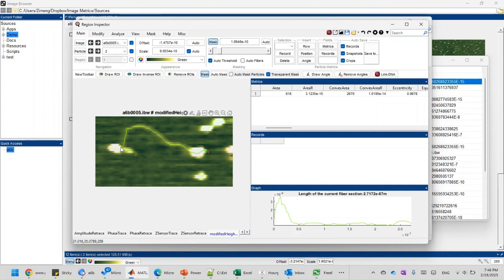But if you actually do that, the trace right now is not passing through the second molecule. As you can see, there's only one peak instead of two. Now you have to force your way inside that protein complex, right? To do that, there's two ways. The program has two modes of tracing in terms of automatic tracing.